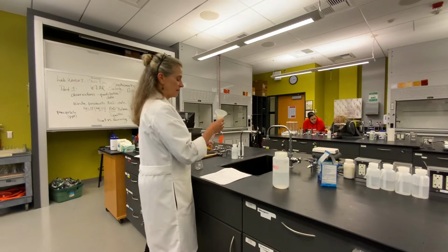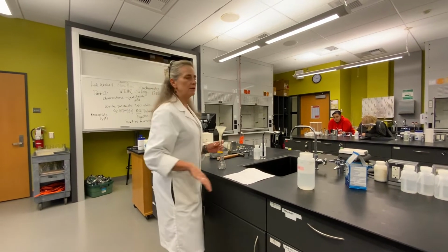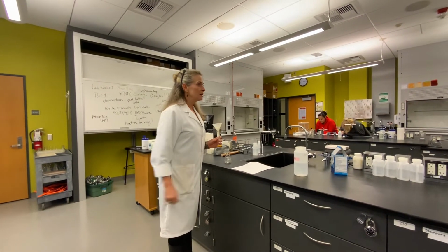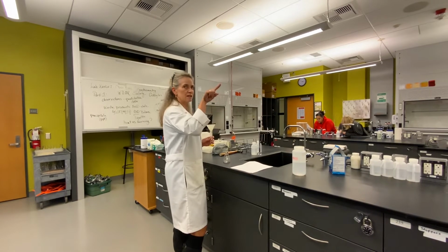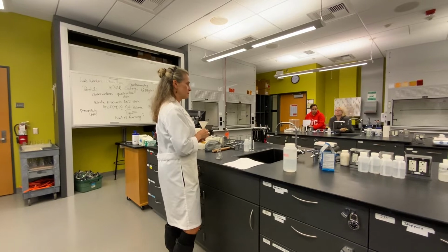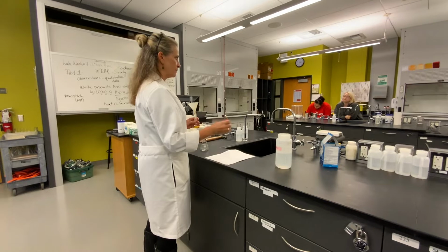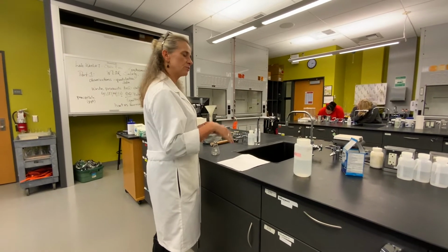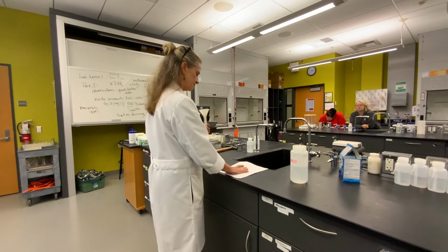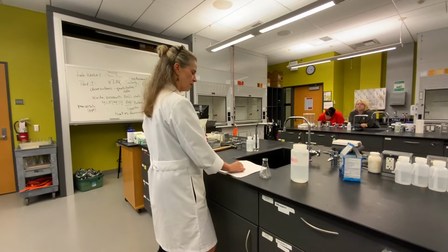What's really lovely and amazing about this experiment is it's all mass-based. And we have really good confidence in the balances as long as you read them right. What I mean by that is we're not reading the meniscus, which is really hard, right? So this is all mass-based, so we should get really good results with this lab, okay? You're going to get the mass of the graduated cylinder with about 25 mils. We don't care how much it is, we just want it to be near 25. It could be a little lower, that's okay. Get that mass, and then you're going to mass the empty E-flask. That goes on the chart as well.